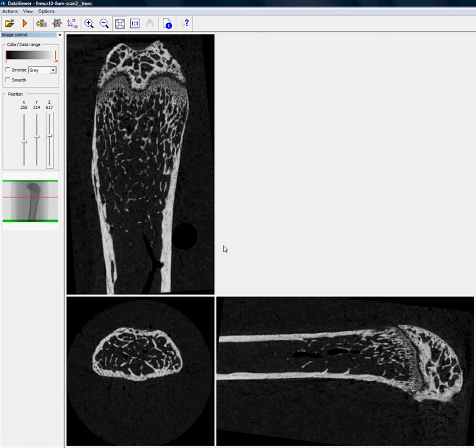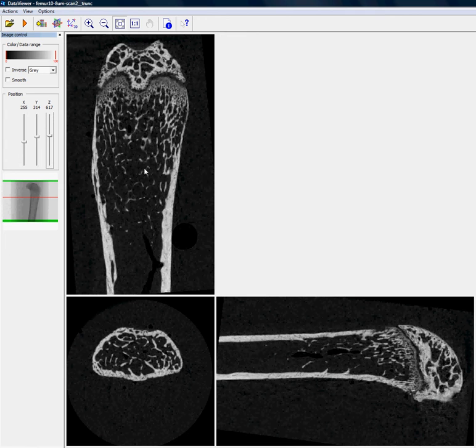Having performed this reorientation, we can now save either a single image or the whole dataset in any one of these three views, the coronal, the sagittal, and the transaxial.